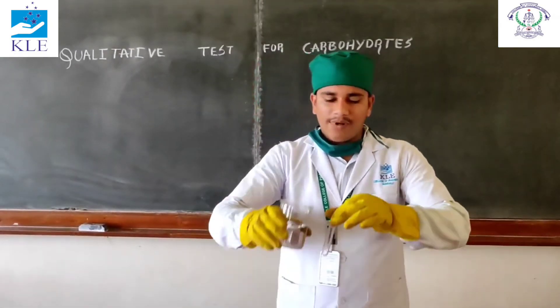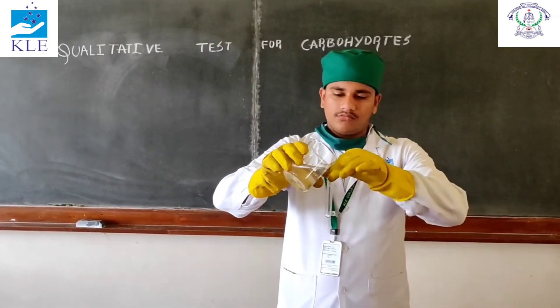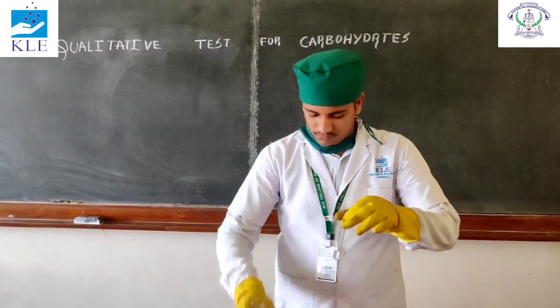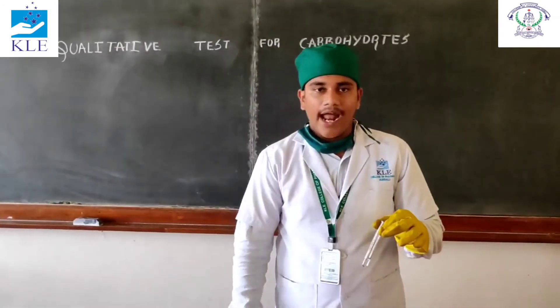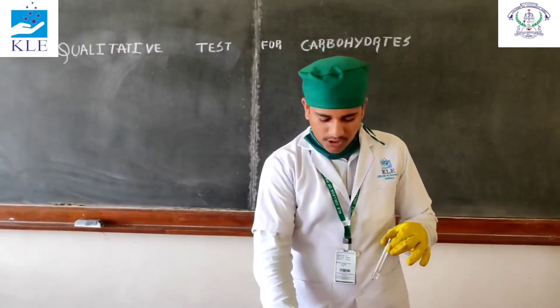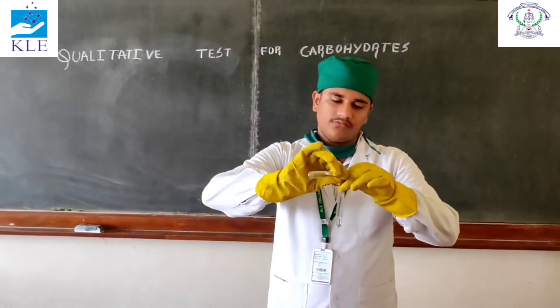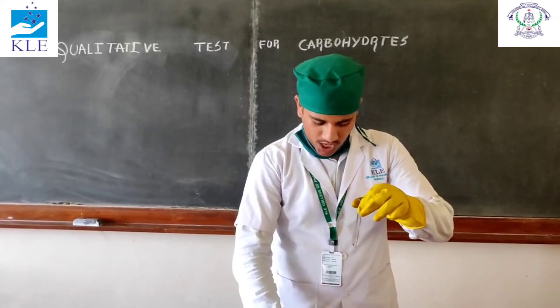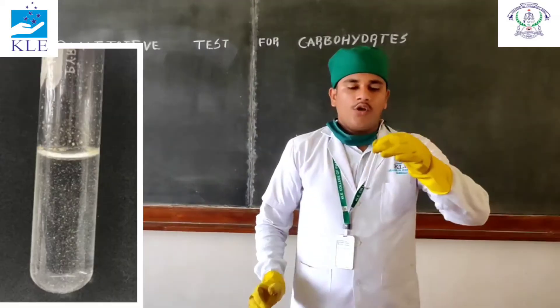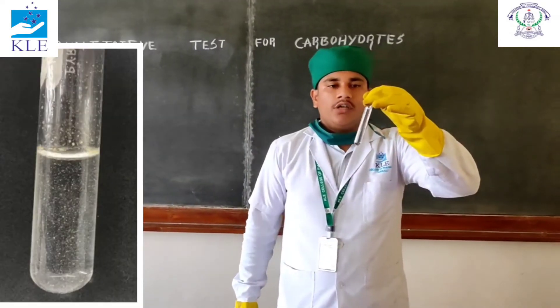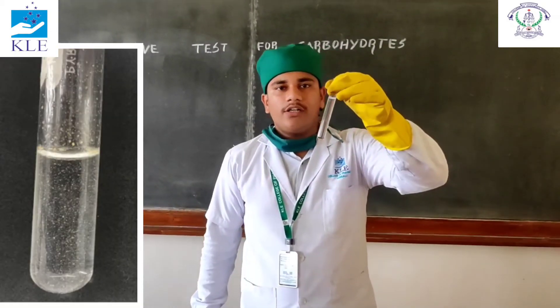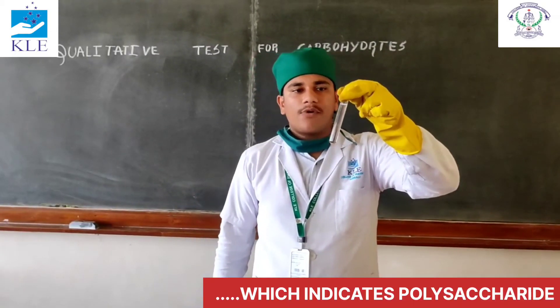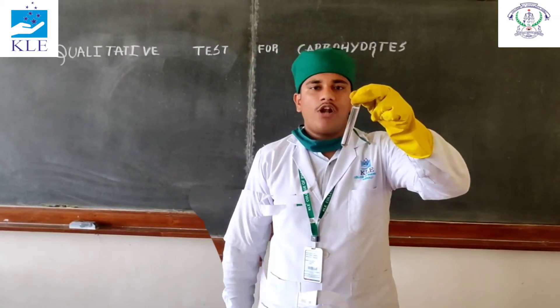Solubility test: take 3 ml of sample solution and add 2 ml of water. After adding, we can observe that it is insoluble in water, which indicates the presence of a polysaccharide.